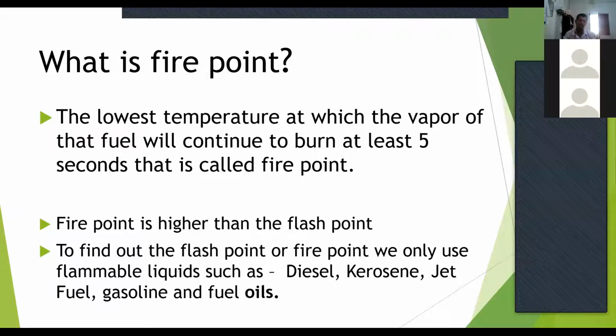That is called the fire point. There will be a gap between the flash point and the fire point of a certain fuel.